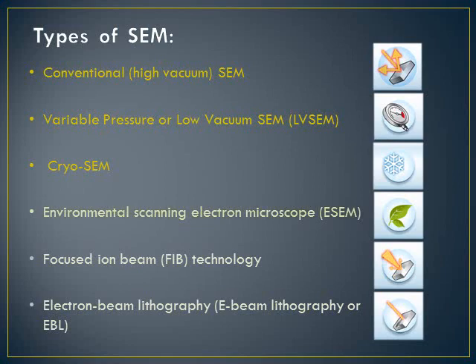Another type of SEM is the environmental scanning electron microscope. This machine is designed to view a sample in its natural state without the need of desiccation. Some examples of experiments that can be undertaken in the ESEM include the determination and imaging of melting dynamics for physical science materials and determination of crystallization dynamics.